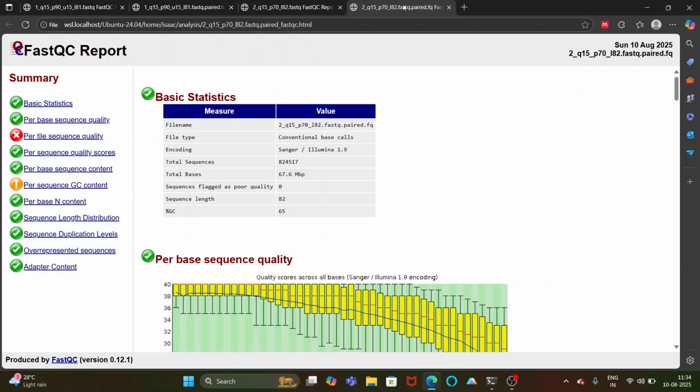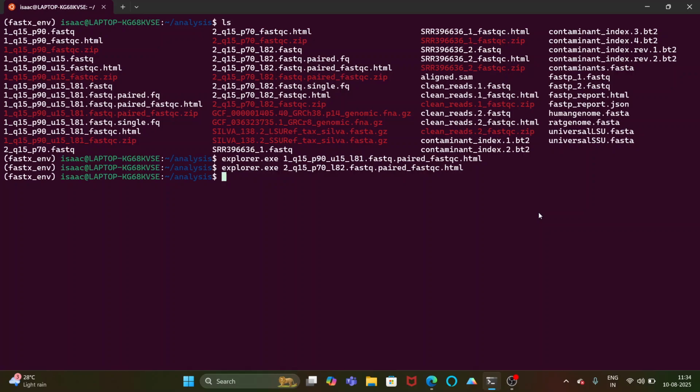So basically this much we will talk about in this lecture. You have learned how to do quality checking of the fastq files using tools like cutadapt, fastq quality filter in the fastx toolkit, and fastq pair for proper assembly and everything. I hope you learned several things from watching this video. Yeah, so thank you.